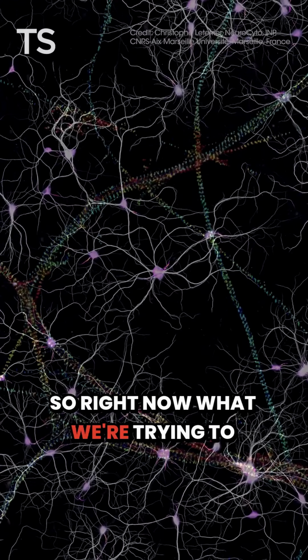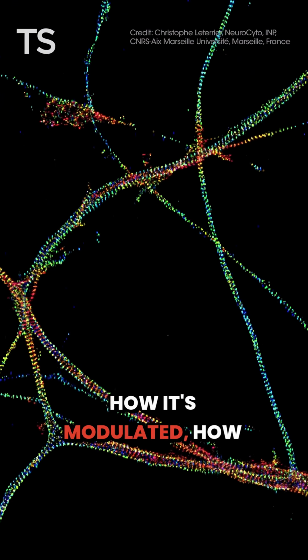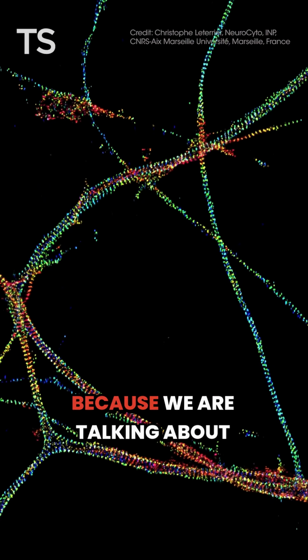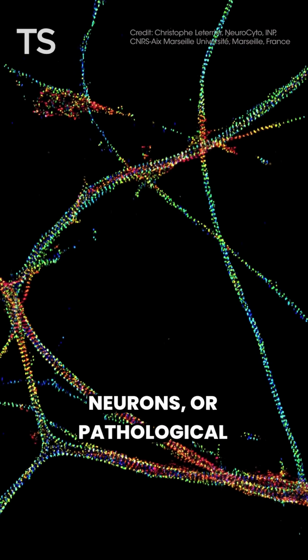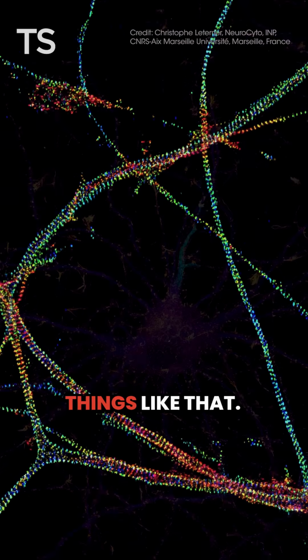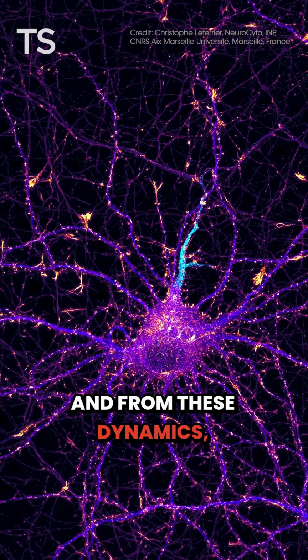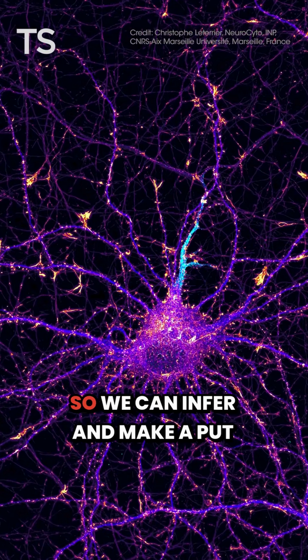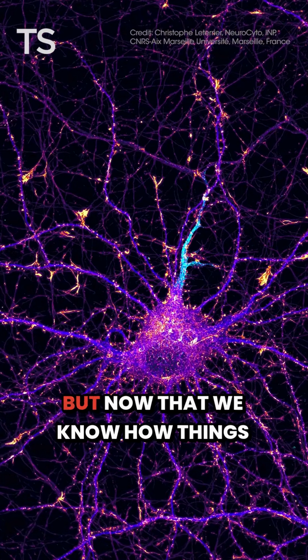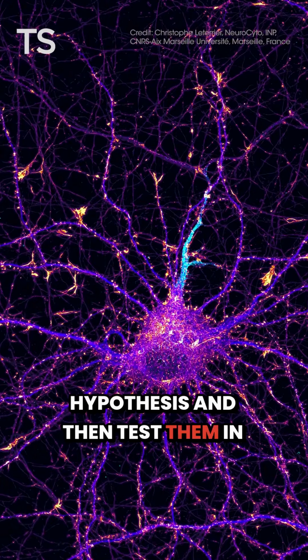So right now, what we're trying to do is to get insight into the dynamics of it: how it assembles, how it's modulated, how it's transformed during various events like plasticity, because we are talking about neurons, or pathological events like degeneration and things like that. So basically the dynamic history, and from these dynamics, getting hints at function. We can infer and make hypotheses about the function looking at fixed photographs, but now that we know how things move, we can make much better hypotheses and then test them in a functional way.